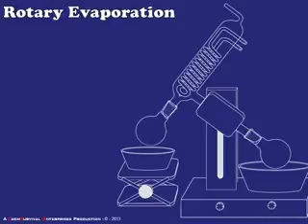So now that we've looked at some similarities here, let's go all the way through this rotary evaporator and identify all of the essential parts and what they do. I'll be referring to the round bottom containing your sample solution as a boiling flask. There's also a rotational unit, which is basically just a motor that spins that stem of the boiling flask right along the axis that goes through the opening. And we'll talk about why we do that in a little bit.